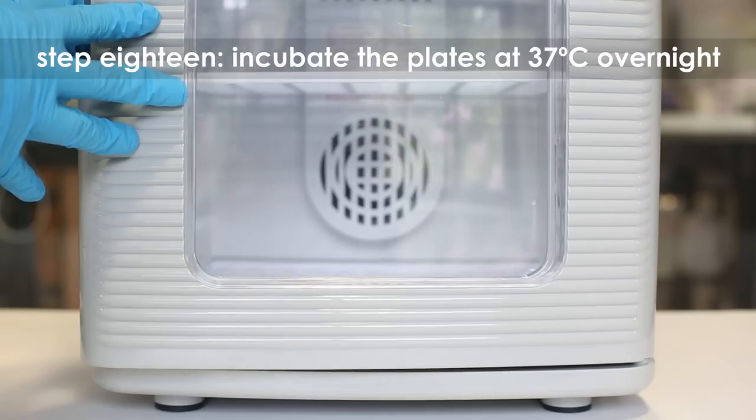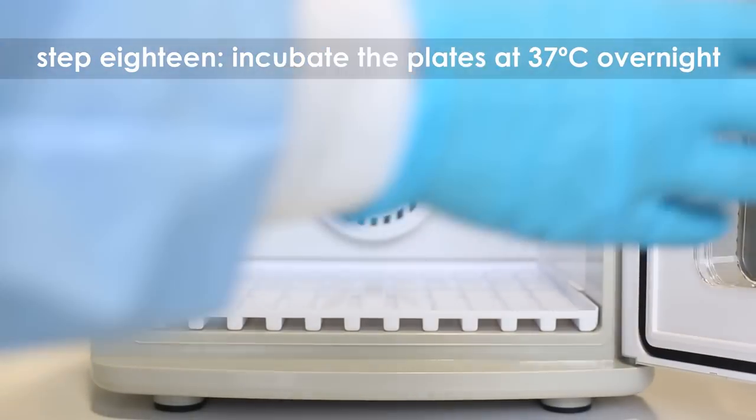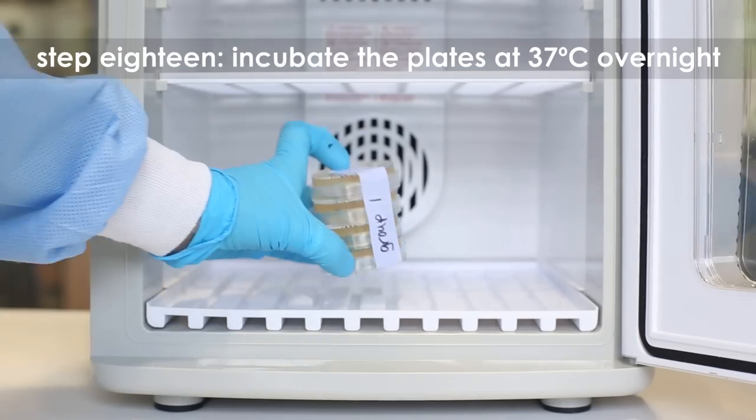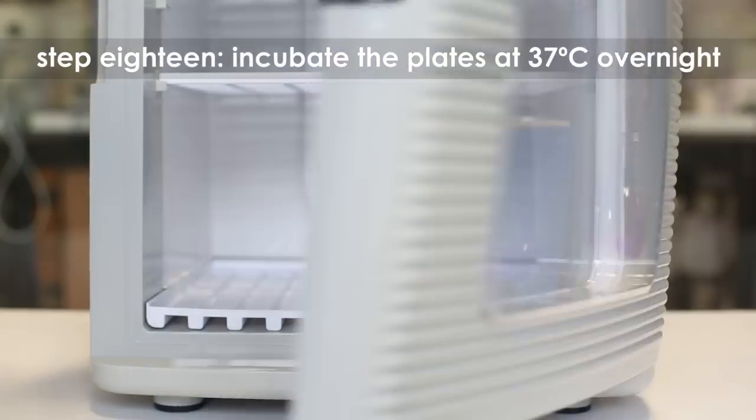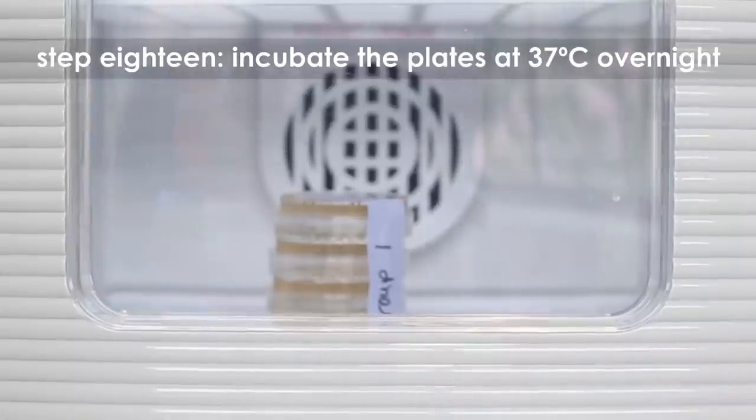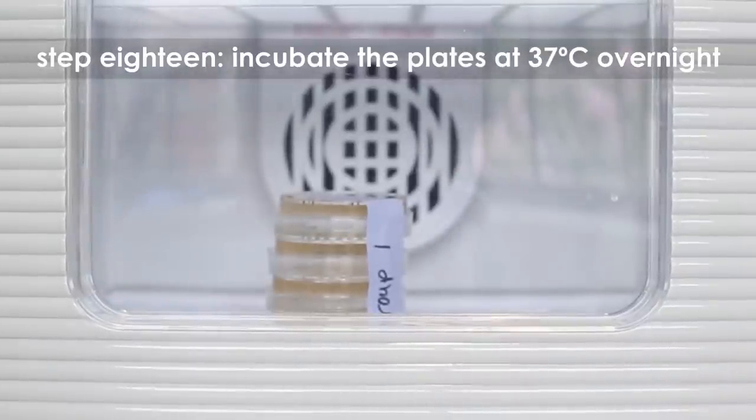Step eighteen: make sure the liquid has completely dried before inverting the plates with the agar side on top. Place the plates in a 37 degrees Celsius incubator overnight.